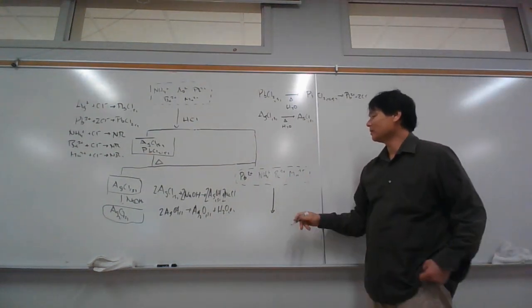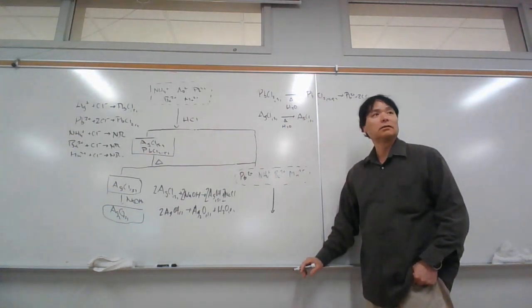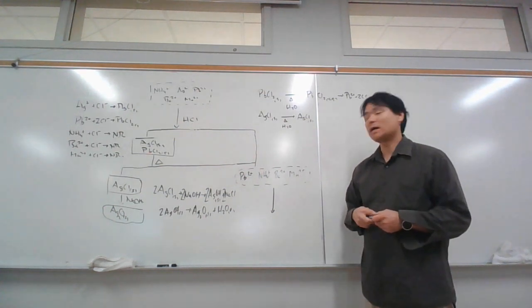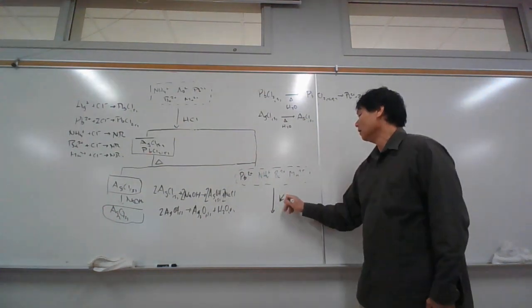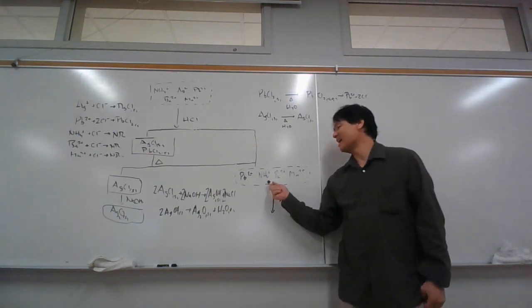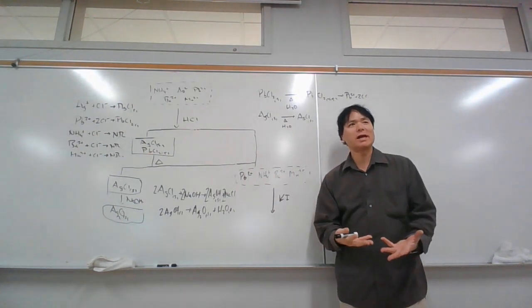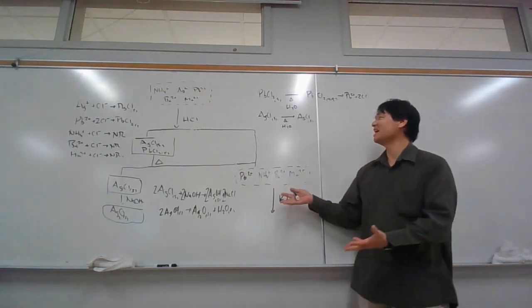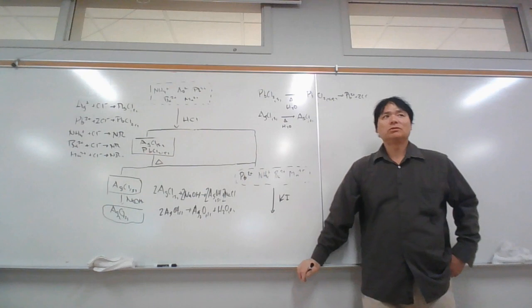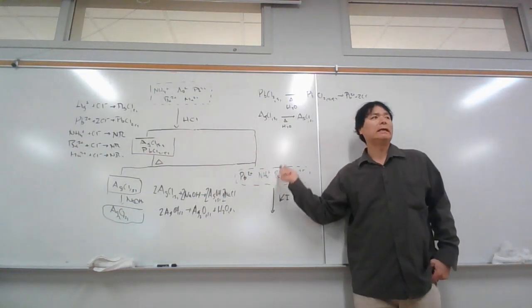Okay, the next step is we're going to add, what are we going to add? Bisulfate? What's the next step in the flow chart? Potassium iodide. All right, now what's going to happen is as the filtrate or the supernatant cools down, what do you think is going to happen? If this cools down, lead 2 chloride is going to precipitate. So if you see a white precipitate forming here, heat it up.